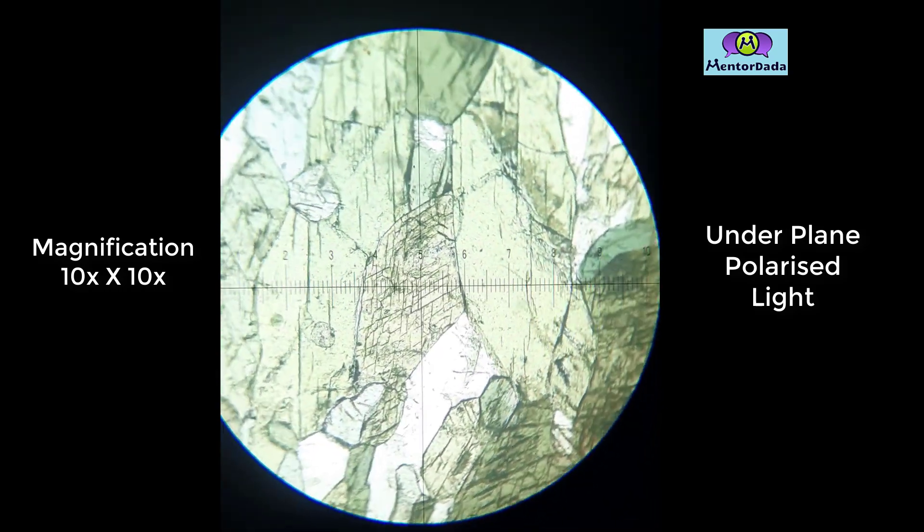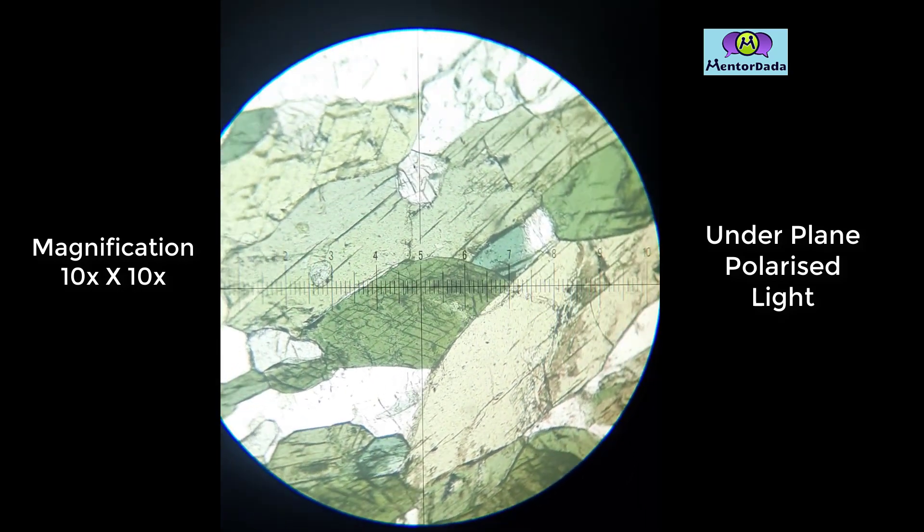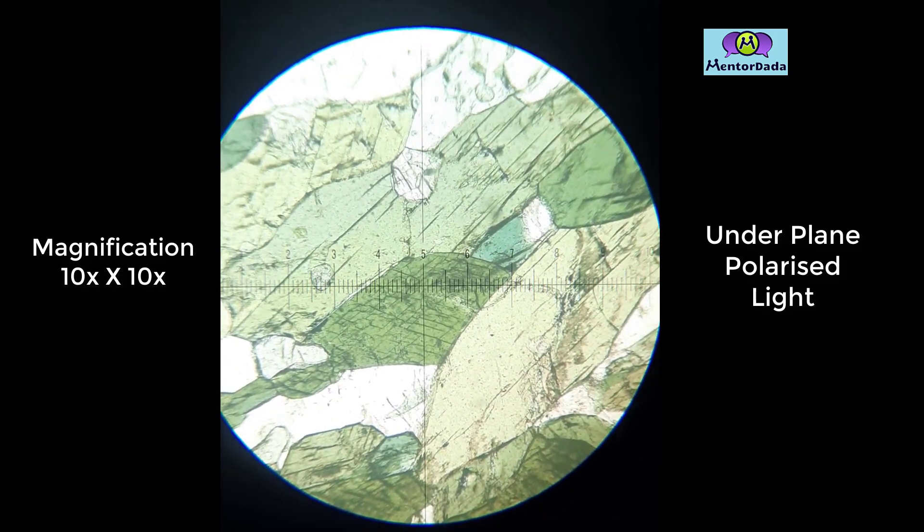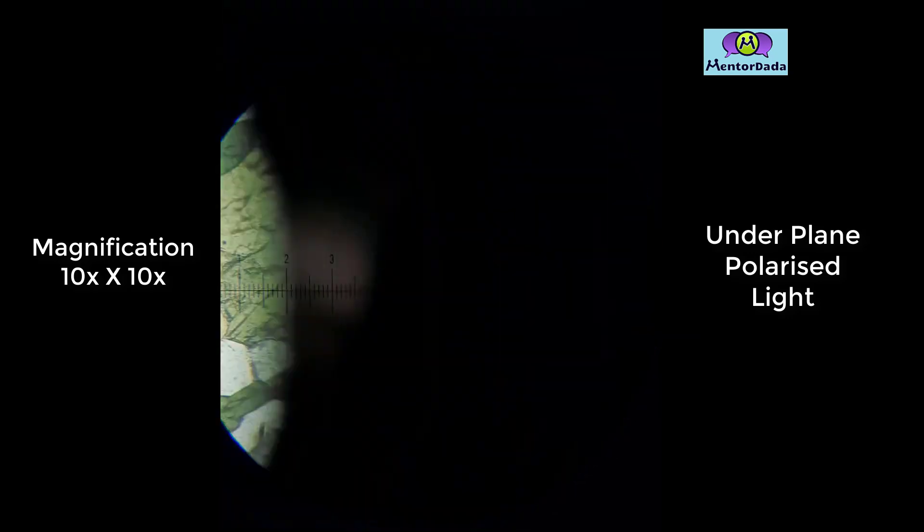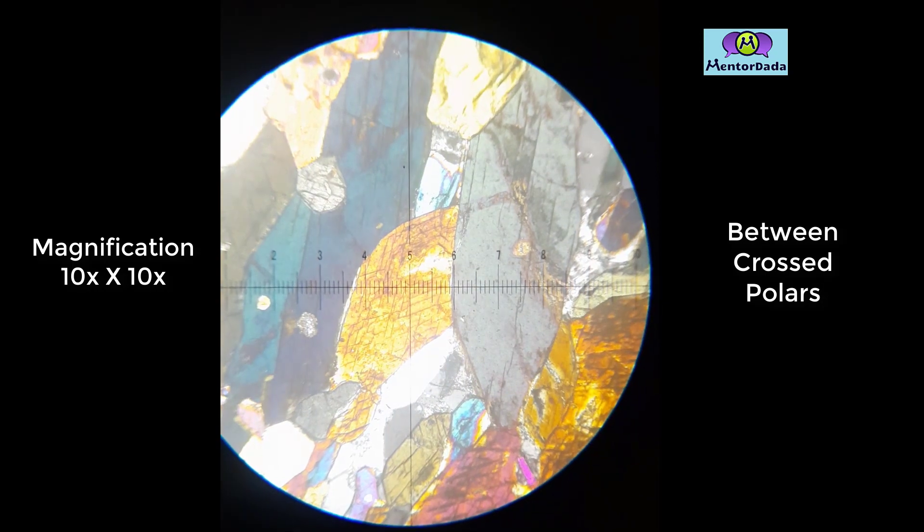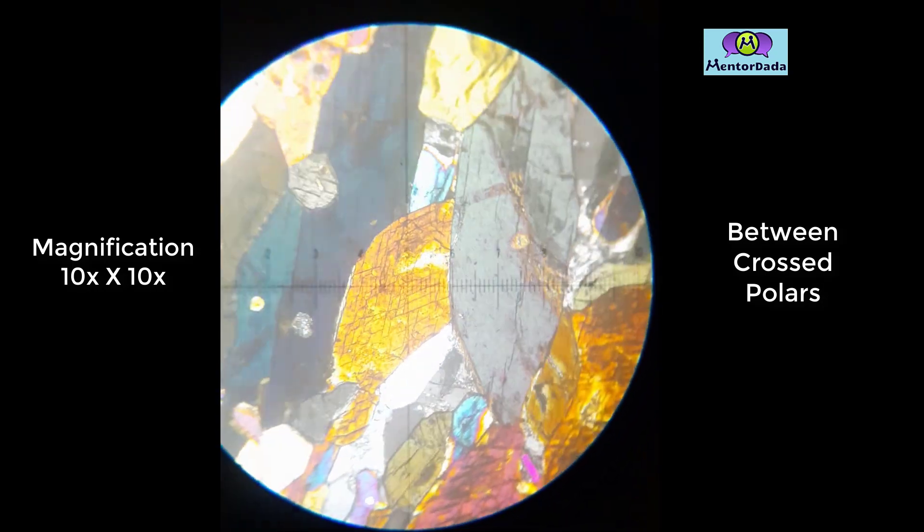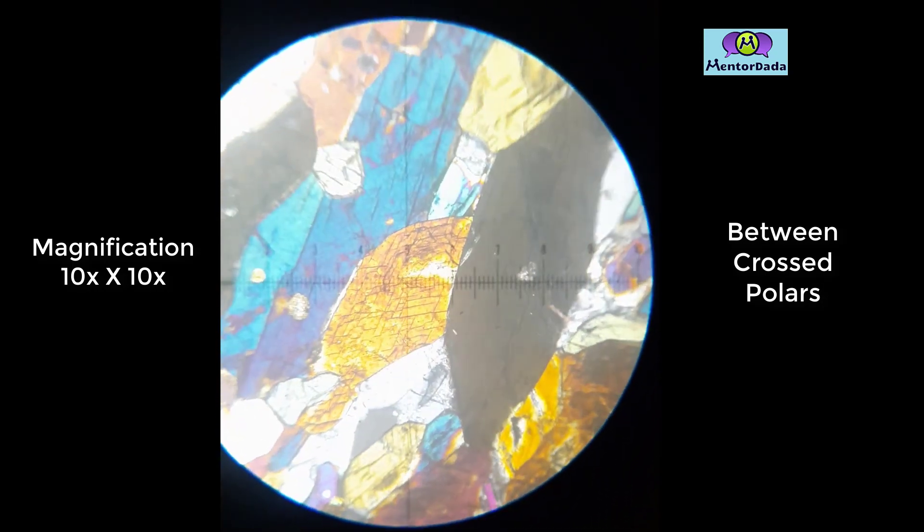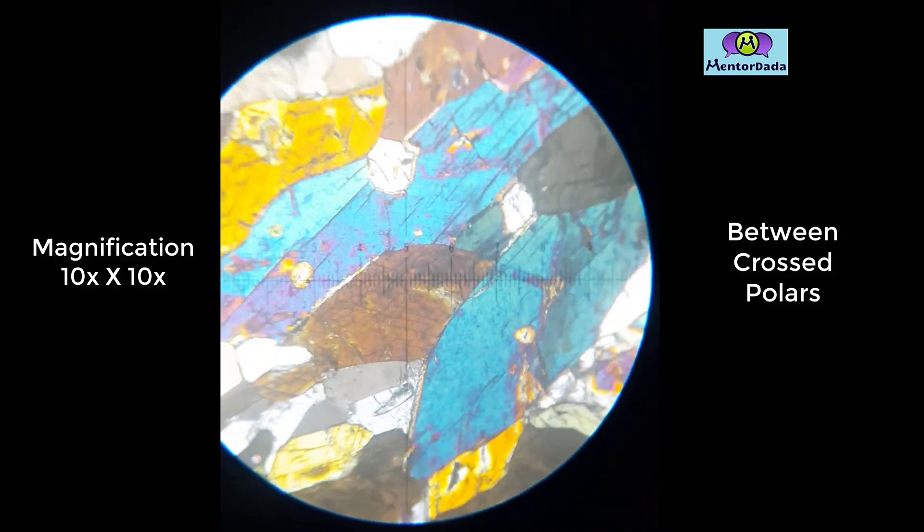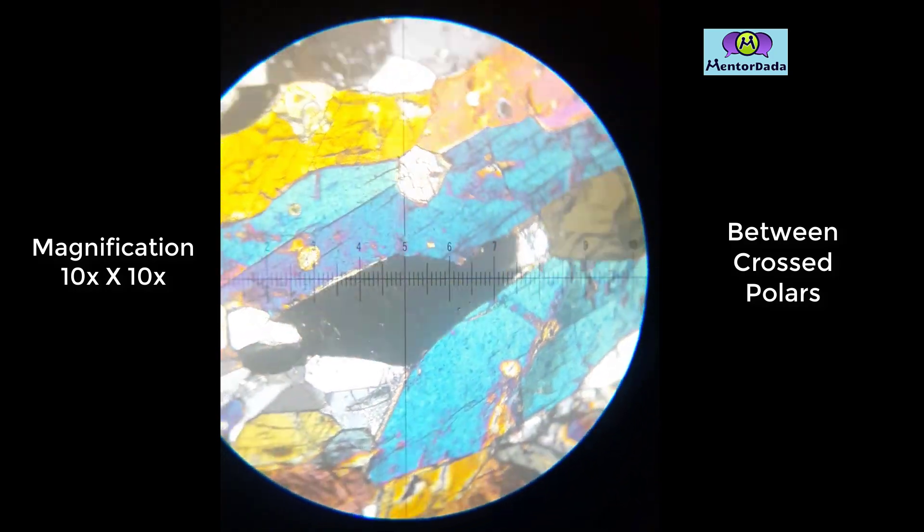The grains are euhedral in shape. Between cross polars, the mineral is changing its color from second order yellow, so the mineral is anisotropic.